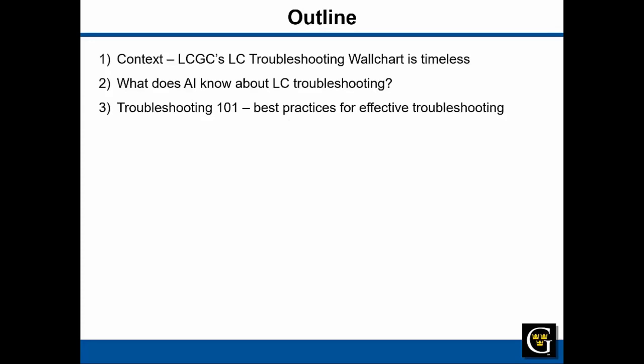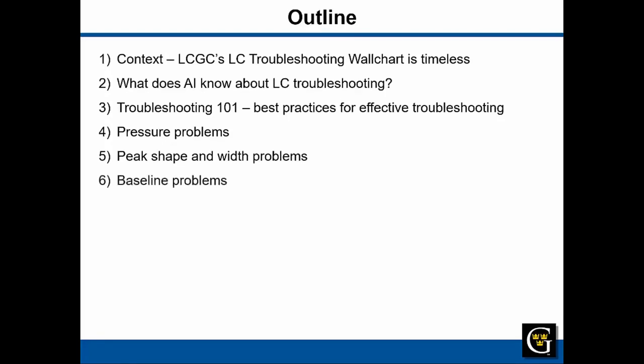So first talking about some of the best practices for effective troubleshooting, and then talking about some specific problems related to pressure, some specific problems related to peak shape and width, and some specific problems related to baselines, and then we'll wrap things up.